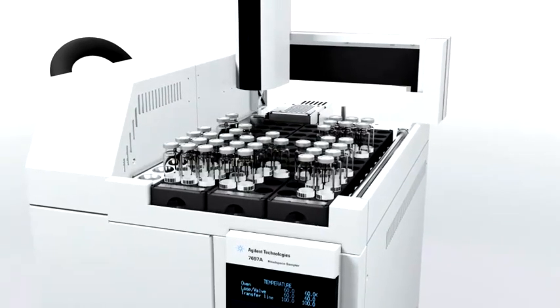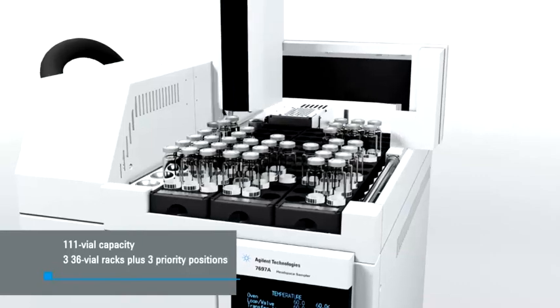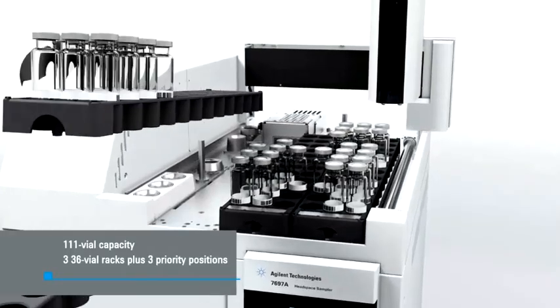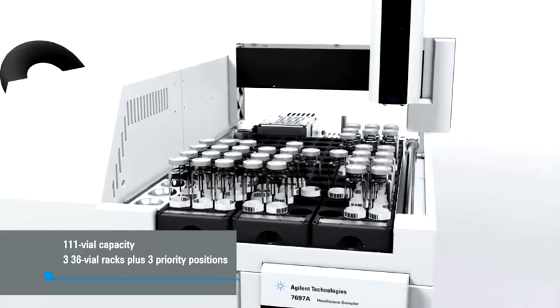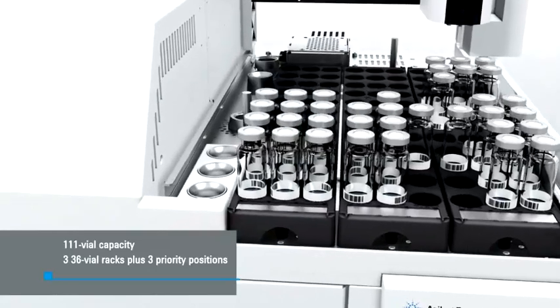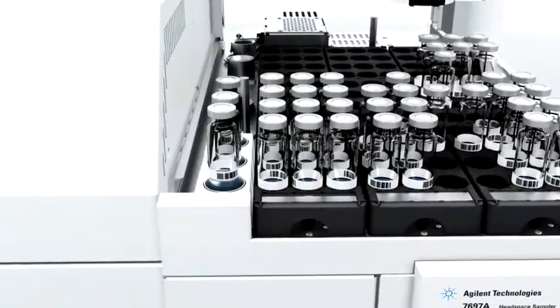The sampler is designed to maximize productivity and can hold up to 111 vials. Three 36-vial racks can be exchanged while the Headspace Sampler is operating to enable high-throughput operation. Three priority positions allow you to easily insert urgent samples into the queue at any time.